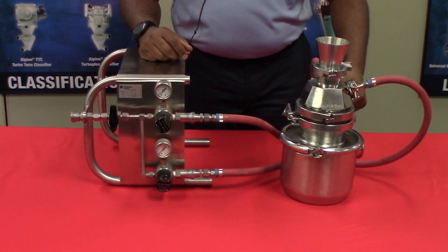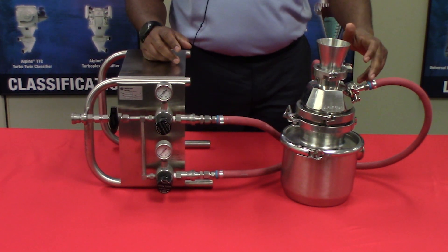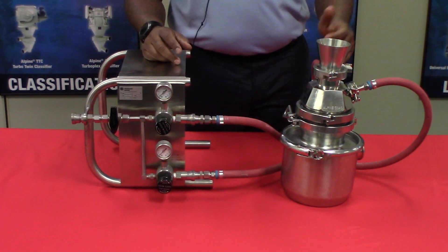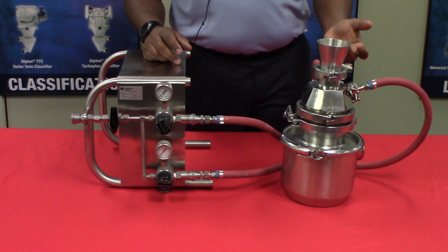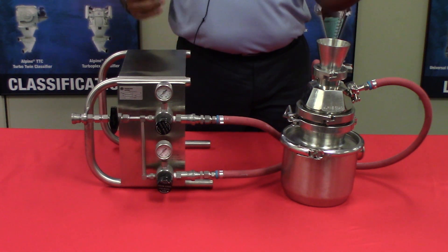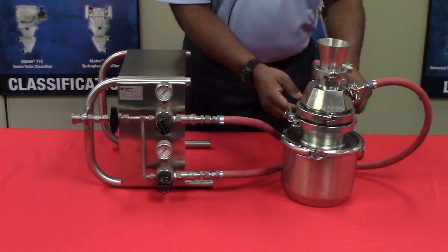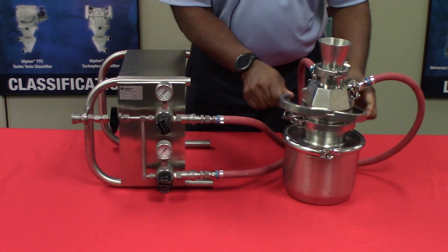Let's disassemble the mill. You have two pressures: an injector pressure and a grinder pressure. The injector pressure acts like a venturi to pull the feed material into the mill, and then it accelerates the particles into the mill where grinding occurs.